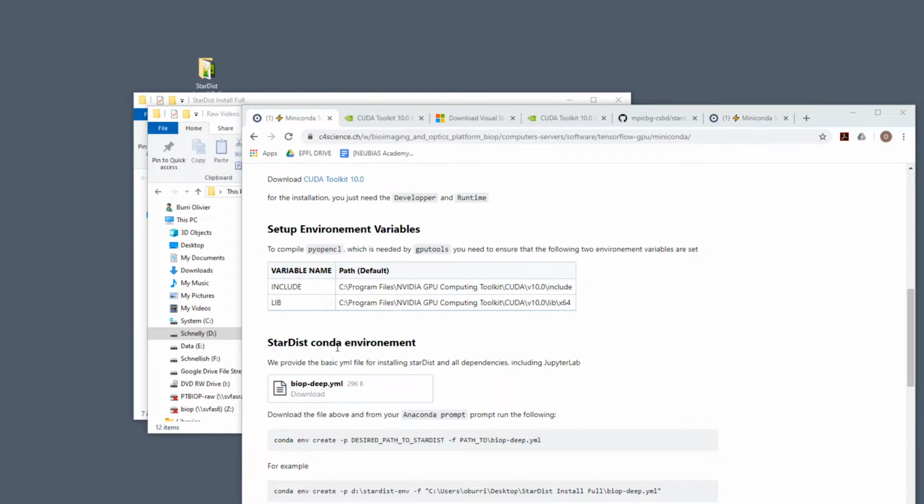So Anaconda is nothing but what's called a package manager and an environment manager. It makes sure that if you want to run StarDist, it'll run with the right versions of all the right tools. And if you run some other tool that needs different versions, then you would need to create another Conda environment for it, and nothing will break your StarDist installation.